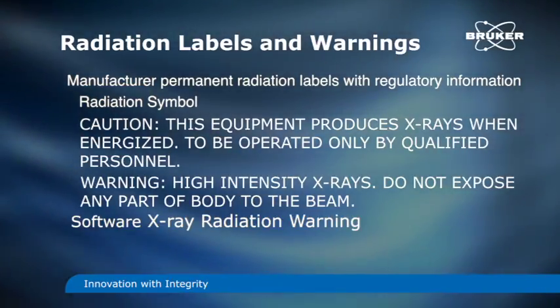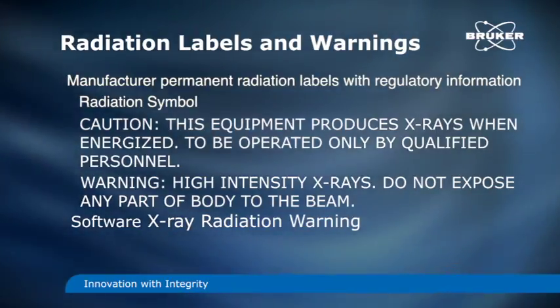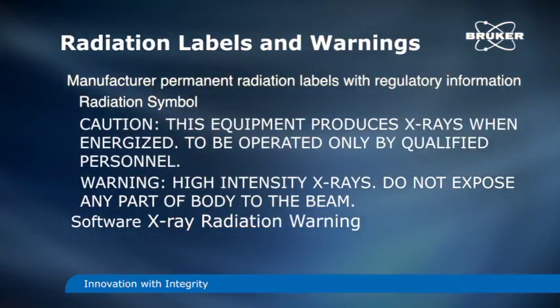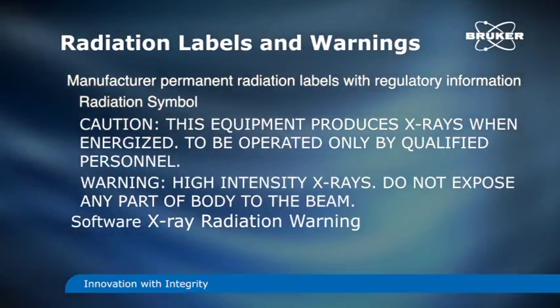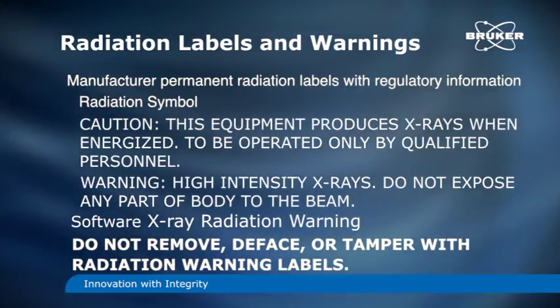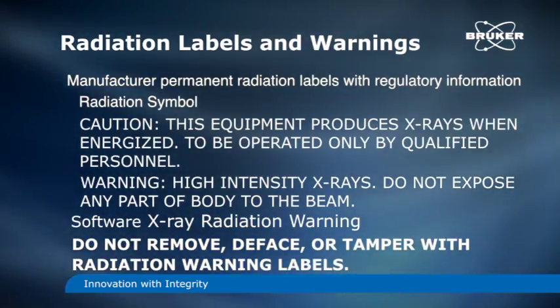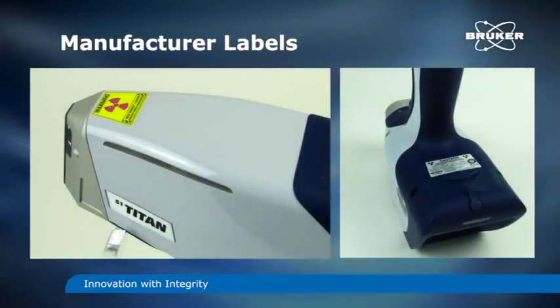A software X-ray radiation warning has been integrated into the design of the S1 Titan. You must pull and release the trigger, acknowledging the warning, before you are allowed to proceed. Do not remove, deface, or tamper with radiation warning labels. Here are some examples of the manufacturer's labels you will see on your X-ray analyzer.